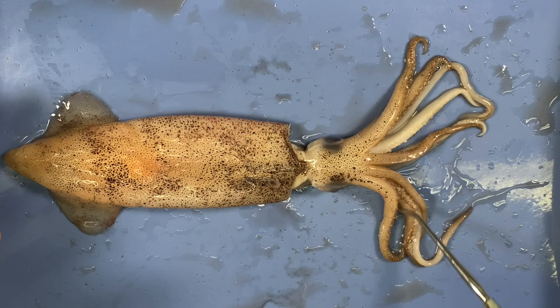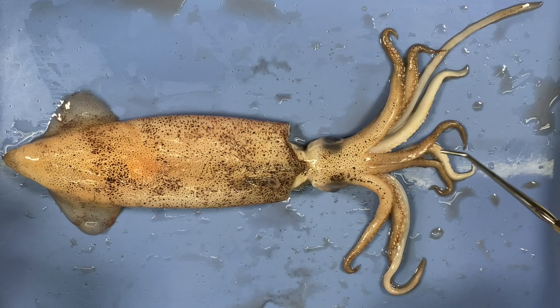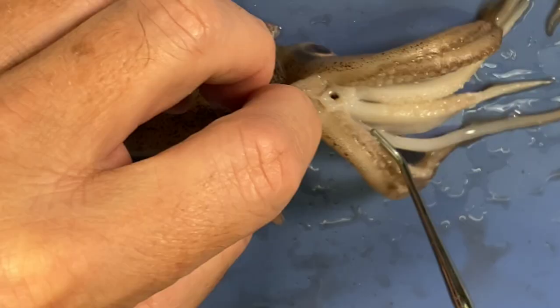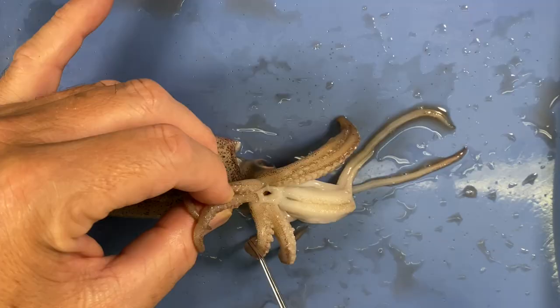The arms are lined with suckers, two tentacles with suckers at the end. The way the animal feeds: it finds a prey item — maybe a small fish or anything small that moves — it shoots the tentacles out, uses the suckers to grab on, pulls the prey in with the tentacles, latches onto it with the arms and suckers, and feeds it into the animal's mouth. It's also got two very large eyes.